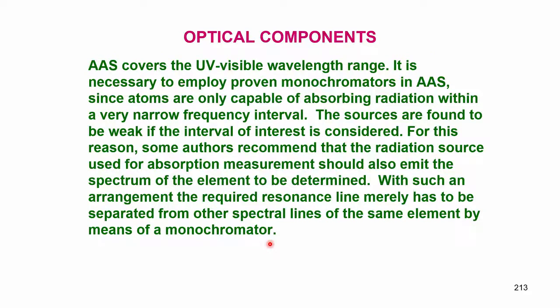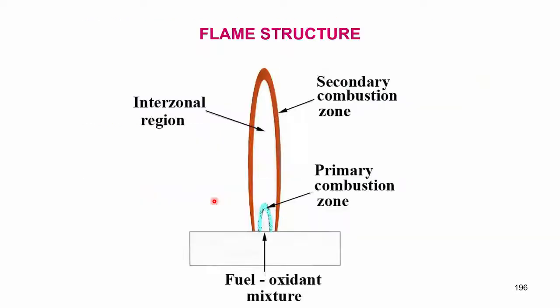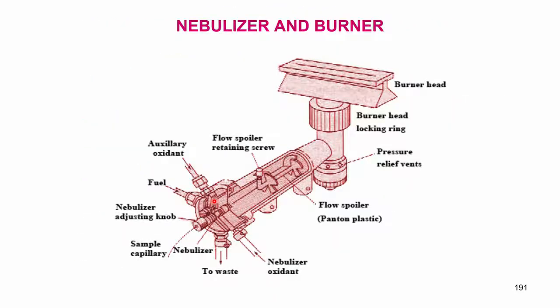Now, a premix burner I am not going to explain to you, because I had already explained to you about the premix burner when I was discussing the nebulizer. If you remember that figure, I will quickly go back and show you that. This is the nebulizer, this is the premix burner, long slot, number of holes, and burning will be there. I had already explained to you, and we are not going to discuss this further.